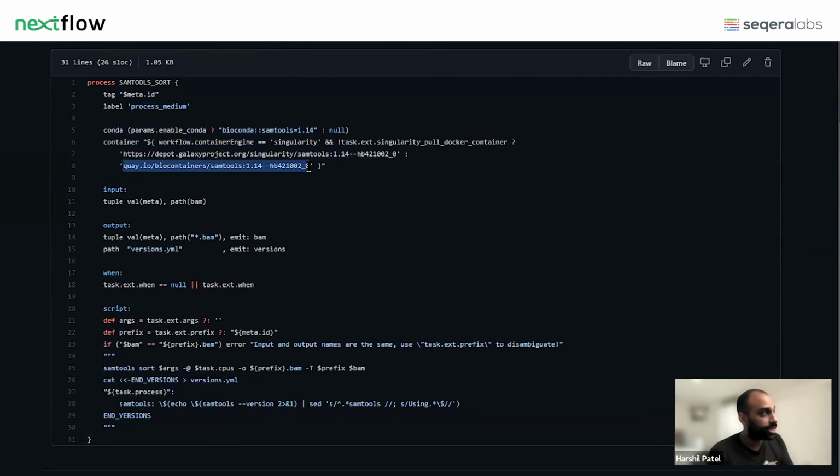If you don't know what biocontainers are, essentially Docker containers for Bioconda packages. And so they're very useful. They're open source. It's all available out there. So we're essentially just reusing what the community is already creating for us. So once a Bioconda package gets updated, or a new package gets updated, they immediately become available as Docker containers. There's also a Singularity mirror as well. So if you're using Singularity, it saves having to convert the Docker image to a Singularity image.